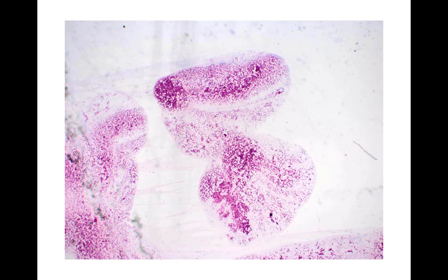Because normal pituitary tissue, if it's got a normal architecture, the cells like to stick to each other and don't like to touch off. They'll stay stuck to themselves and will not touch off on the glass slide. On the other hand, a tumor, a pituitary adenoma, tends to be looser, it's lost normal tissue architecture, and won't stick to each other very well. If you touch tumor tissue onto a glass slide, it'll touch off and stick to that glass slide and stay there. So that's what we've done here.